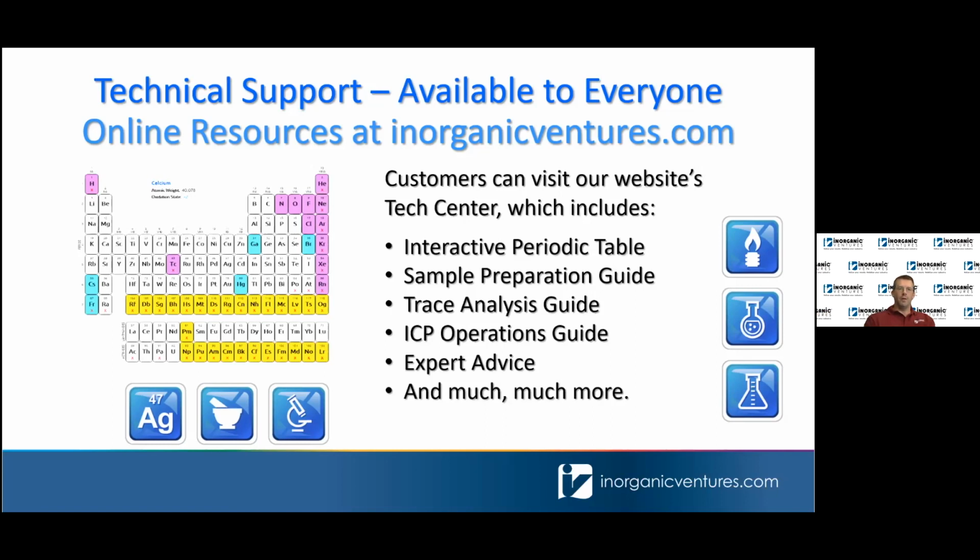Another comment from Steve is just regarding switching valves and rotors on some of these sample introduction systems, and that they can accumulate small quantities of insoluble silica from plant or geological samples that can also grab some metals. So it looks like he has some experience with these switching valve systems, and that you need to be careful about what would appear to be long-term memory issues, and particularly related to insoluble silica. So that's super fantastic, Steve. Thank you for that. A couple more questions have popped up, so we'll start on those.